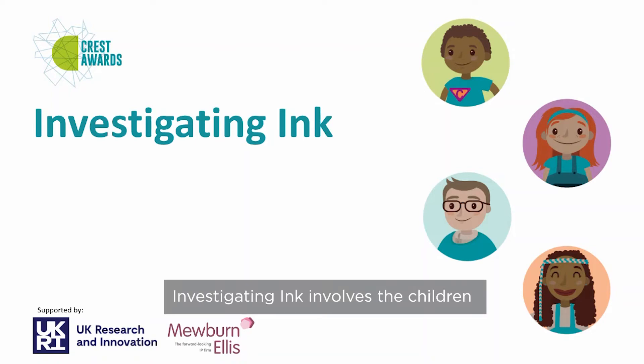Investigating ink involves the children using chromatography to identify the pen used for a ransom note. It doesn't link to the national curriculum but is a fun problem-solving activity.